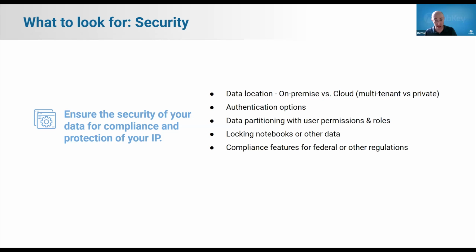You might need some kind of GXP compliance, 21 CFR Part 11 compliance. You may have specific business rules based on the way you construct your contracts with clients. Make sure you know what those are and make sure that the software you consider allows you to comply with them. There are, of course, many other security considerations, so I will simply, for now, repeat my invitation to include your IT and security people early and often.